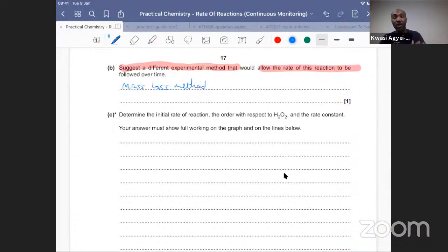So you'd put a conical flask on your balance and hydrogen peroxide into that conical flask. Obviously the balance would be tared, so the starting mass would be 0, and then over time you'd see that the reading on the digital balance should go into minus territory as oxygen is produced and leaves the flask. Okay, so that allows you to measure the mass lost due to oxygen leaving the flask. So you can use that.